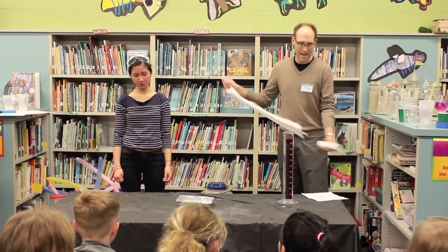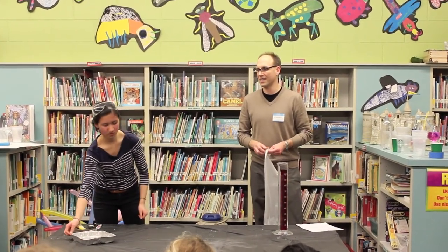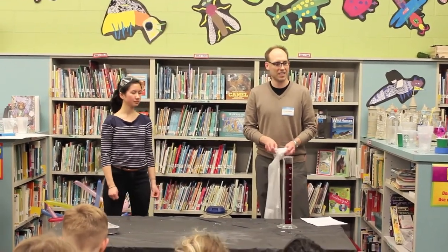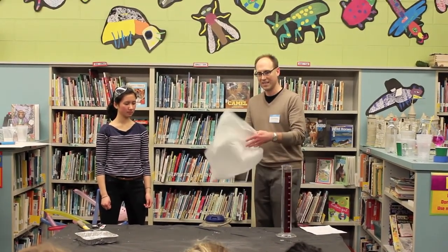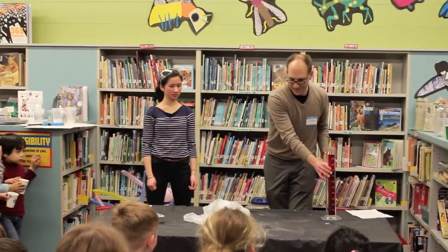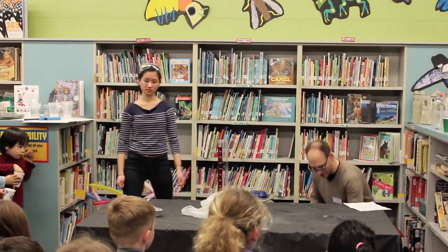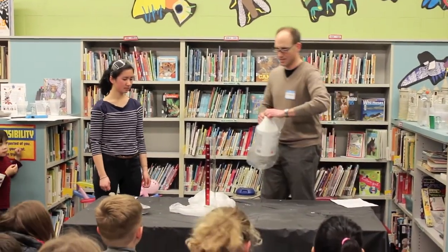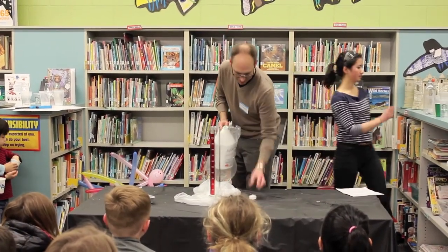This is a kind of cool reaction. What we're doing here is we're going to take concentrated hydrogen peroxide and we're going to convert it into oxygen gas. And we're going to trap the oxygen gas in a series of bubbles, which is caught by detergent. It's a very exothermic reaction, which means it gives off heat. So we're going to start with about 100 milliliters of concentrated hydrogen peroxide.